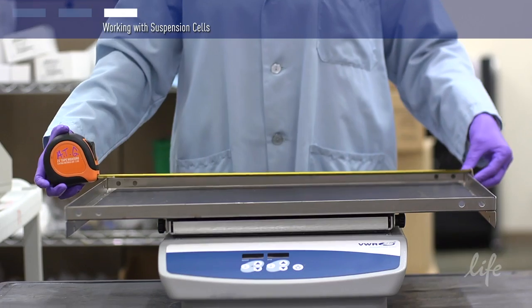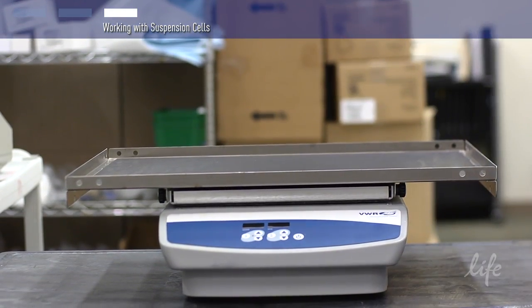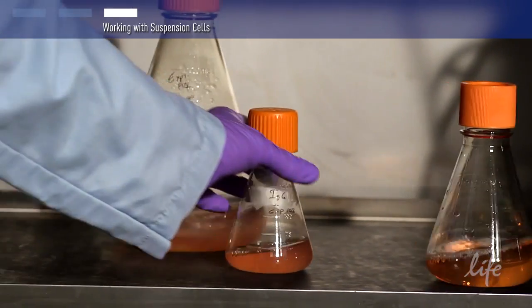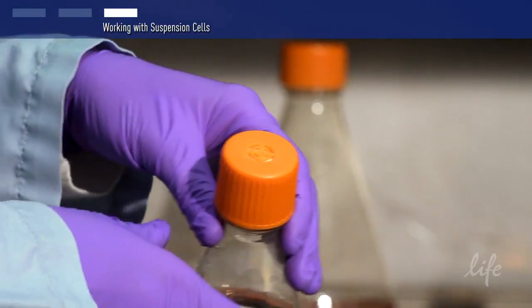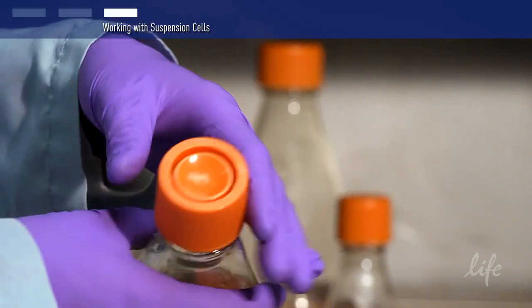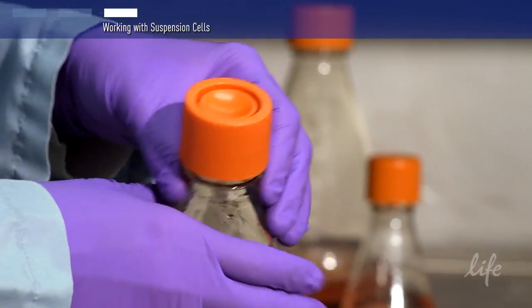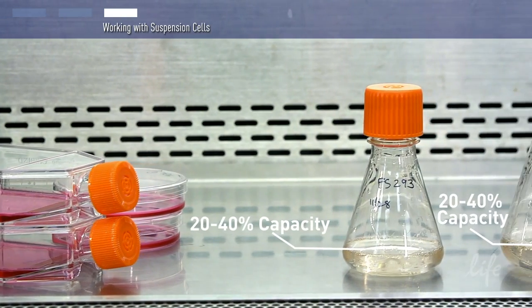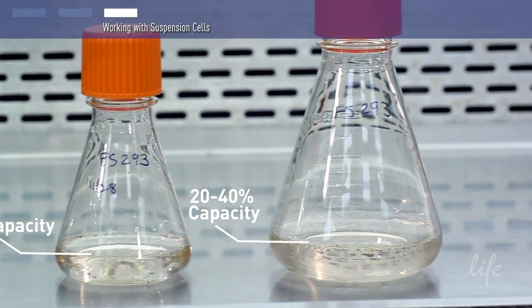Also, recalibrate the incubator temperature after installing the shaker, since shakers generate heat. Suspension cells are typically grown in sterile Erlenmeyer cell culture flasks. We recommend vent cap flasks, as these will allow for gas exchange while also keeping the flask sealed against contamination. You can also use non-vented caps as long as you loosen the caps. Another tip is to only fill each flask to 20 to 40% of the rated capacity, as this will allow for adequate mixing and gas exchange.